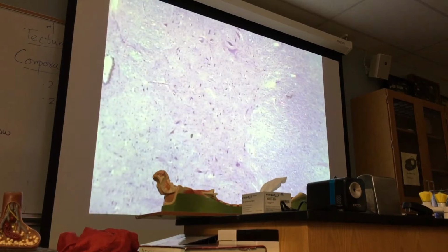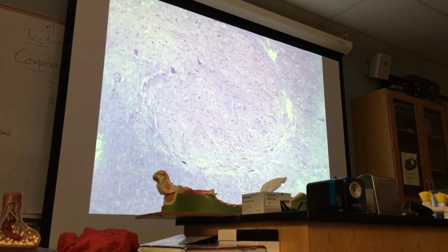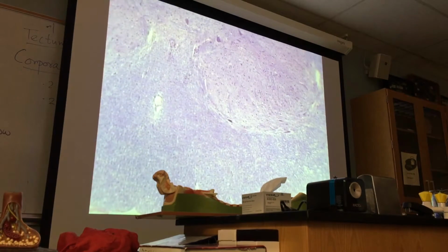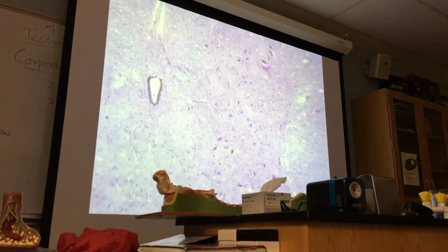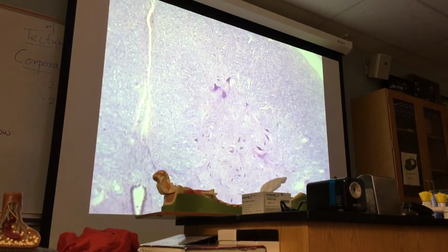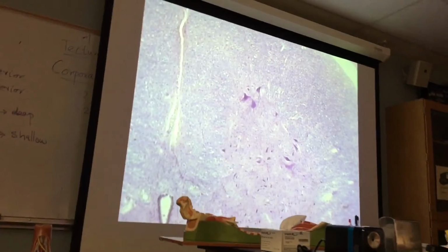This is the lateral column of white matter. This is the dorsal horn of gray matter. This is the dorsal column of white matter. So white matter, you have to identify on the dorsal side, on the lateral side, and on the ventral side. Okay? I think I will talk on this. I'll spend about 10-15 minutes before I go over this one more time, all right?